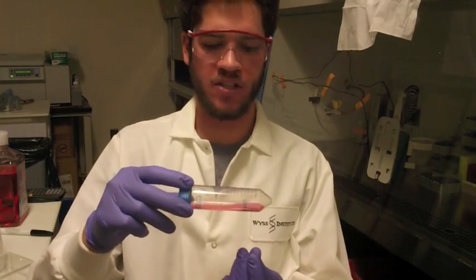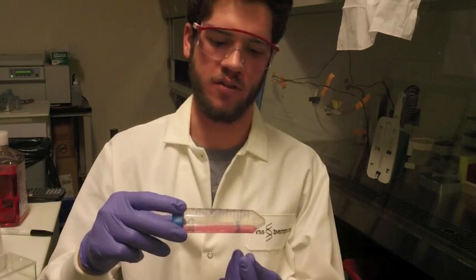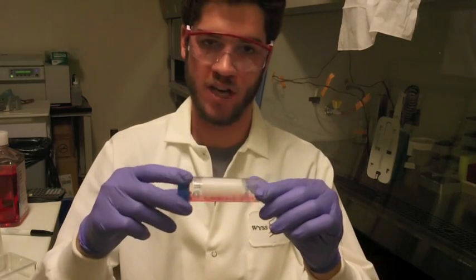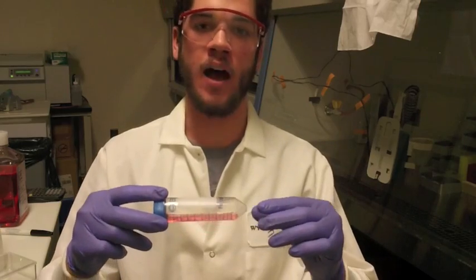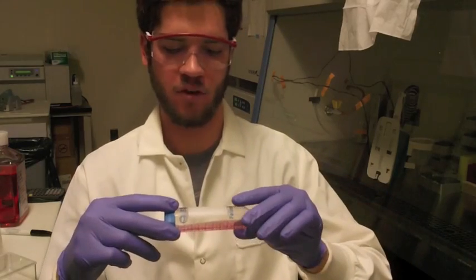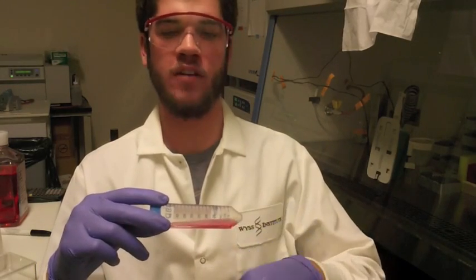By placing an optical sensor on the bottom, you can detect the density of the cells on the substrate and then increase the rate of rotation or slow it down in response to the density, such that you can keep it at a steady state right where it's useful. So speeding up rotation would thin the cells out because they wouldn't have enough time to grow to meet the new media, and slowing it down would give them a chance to catch up and density would increase.